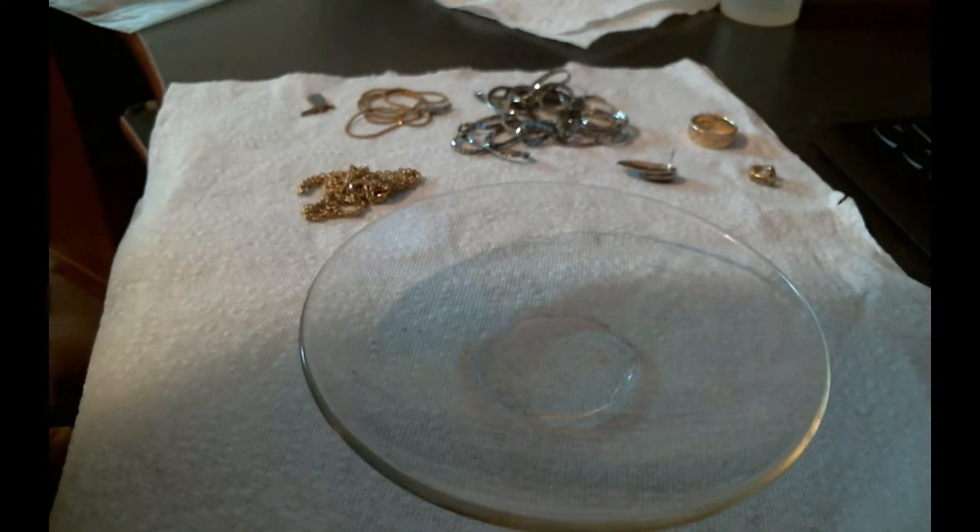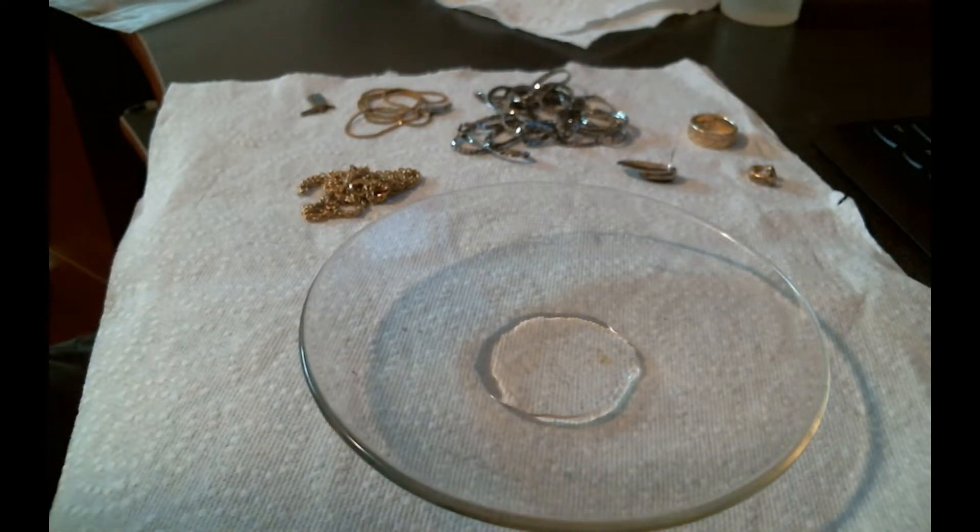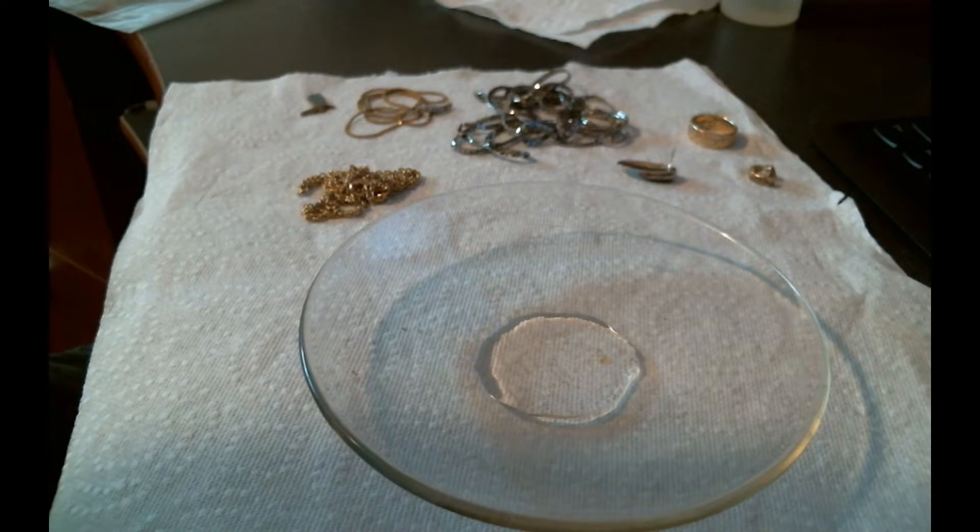How the nitric acid test works is that nitric acid will dissolve base metals, a lot of them, but it will not dissolve gold. It will dissolve silver but not very fast.